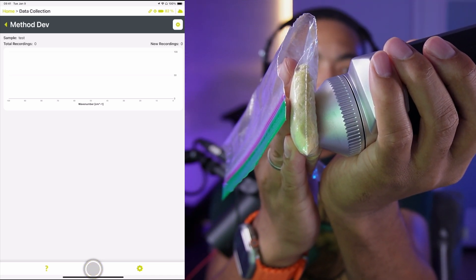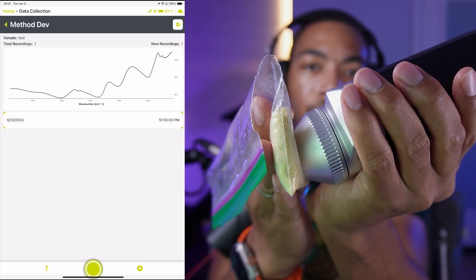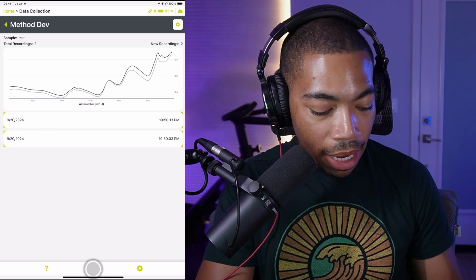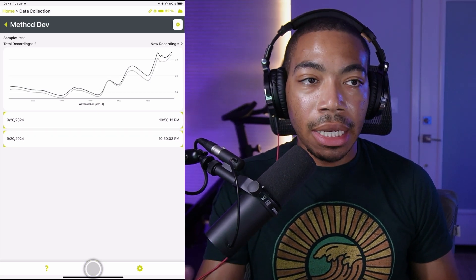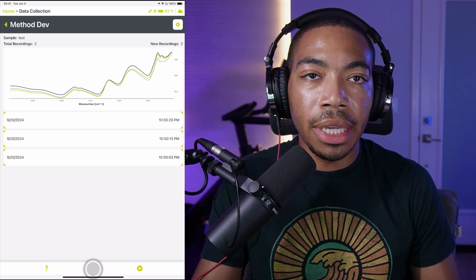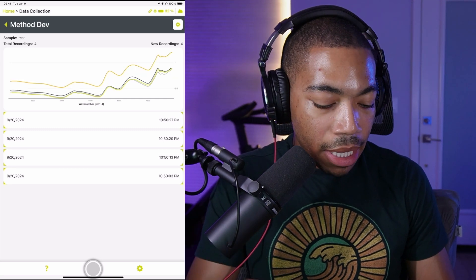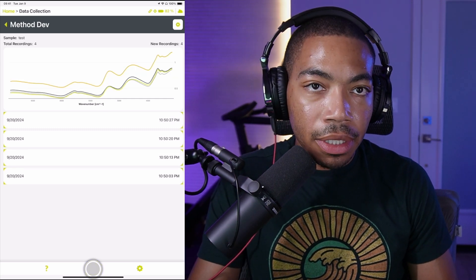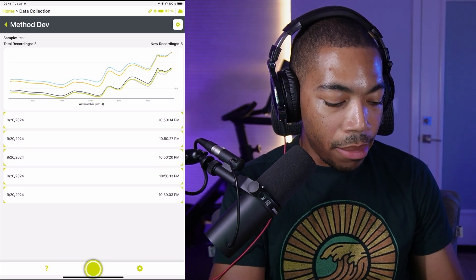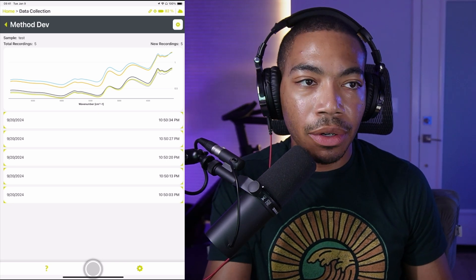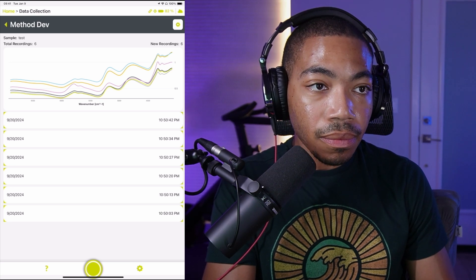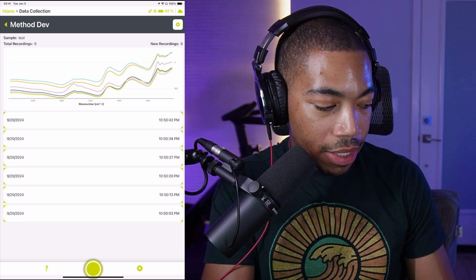I'm going to do this several times and randomly switch between the different bags. In this case I'm not too concerned about trying to classify the different cereals — that could be a different experiment altogether, especially if we start considering things like gluten-free and other dietary concerns. I just want to see if, looking at a bunch of different cereals and this coffee, I see a difference. I'll continue measuring until I get maybe 15 or 20 samples and see how they compare. Just by looking at the data now we can see they do seem to have the same general shape.